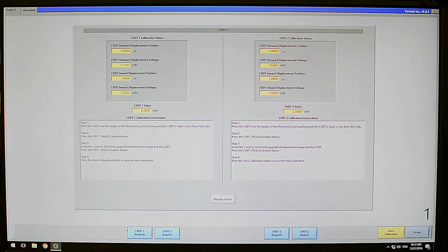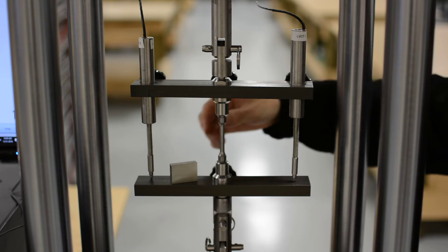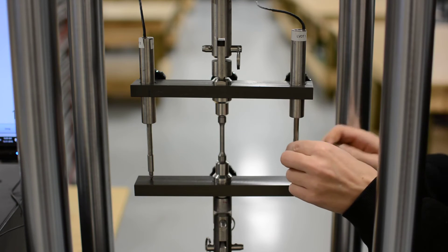Take a moment for the value to stabilize. Then click the button LVDT1 read UL, UL standing for upper limit. Place the 1 inch or 25 millimeter gauge block under the LVDTs probe.